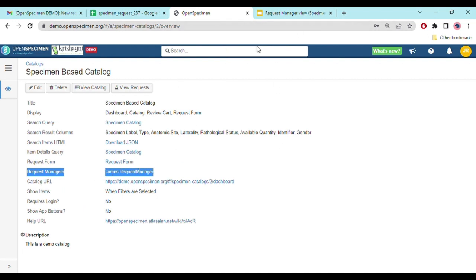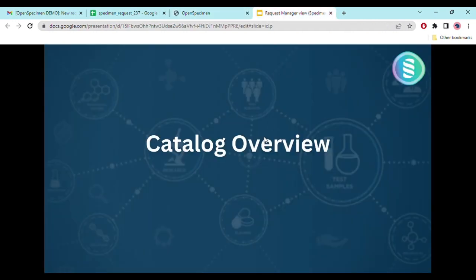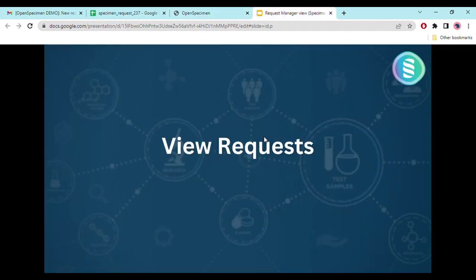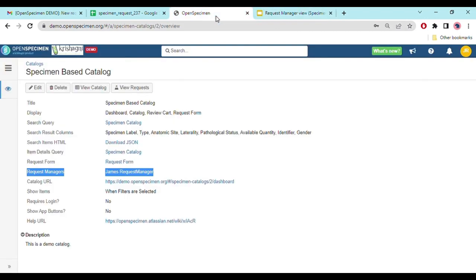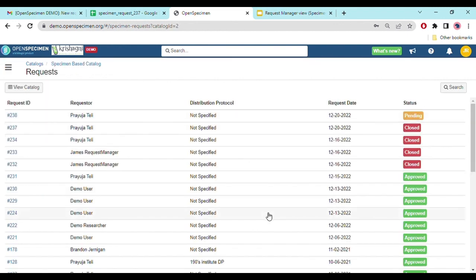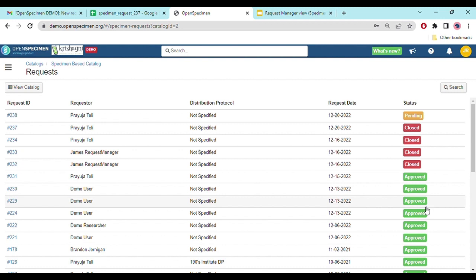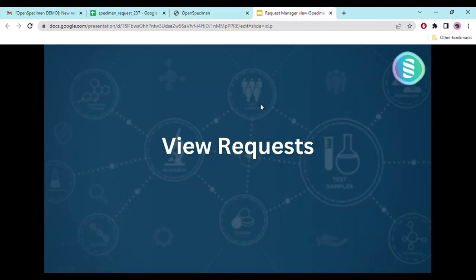This is the catalog overview. The next part we'll see is viewing requests. When researchers put different requests under the catalog, the request manager can view those requests using the 'View Request' option. Once you click on view request, you can see many requests put by different researchers — some are in pending status, some are in closed status because they are already distributed, and some are in approved status.